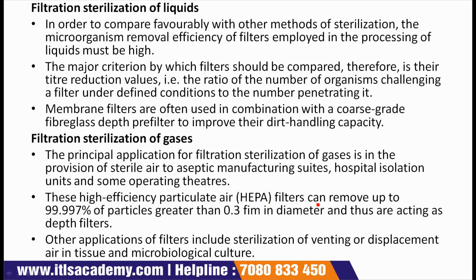And these filters can remove up to 99.997% of particles greater than 0.3 micron in diameter, and thus are acting as depth filters.